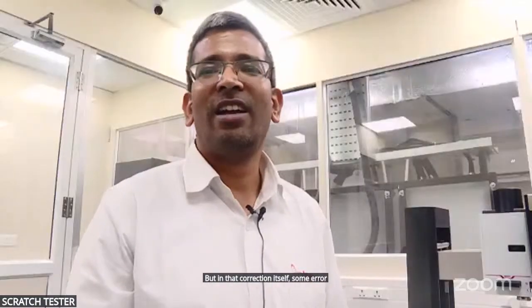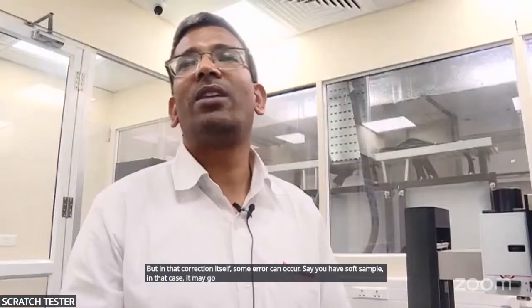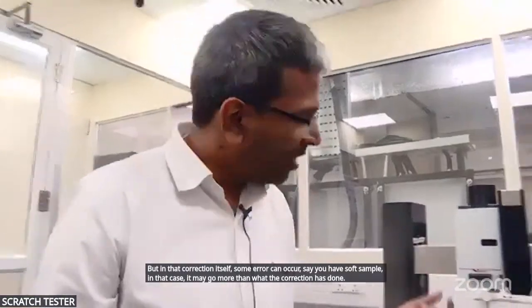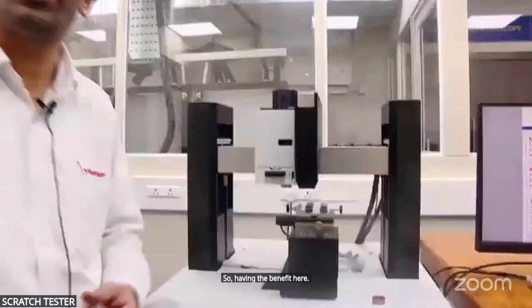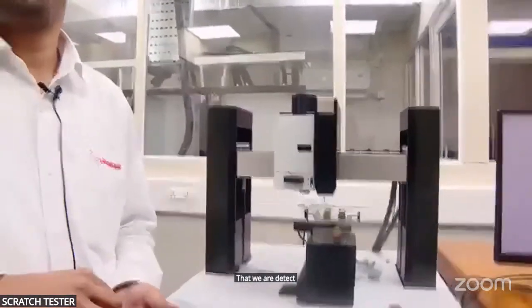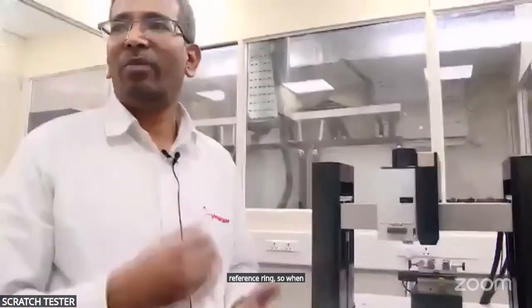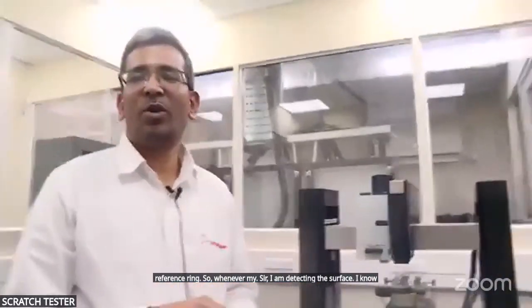But in that correction itself some error can occur. Say you have a soft sample, in that case it may go more than what the correction has done. So the benefit of having the referencing first of all is that we are detecting our surface in a way using the reference ring. So whenever I am detecting the surface, I know what my surface position is.